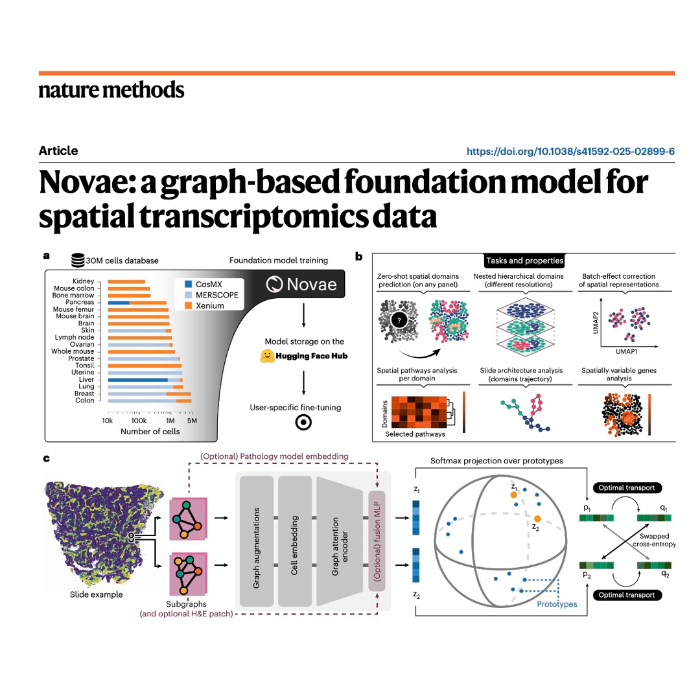Okay, so we have these localized, robust, and translated subgraphs. How does this graph attention network actually learn the identity of those spatial domains? This is where we fuse the SwAV framework with optimal transport. SwAV is a self-supervised method designed to learn structure by agreement. It looks at two slightly different views of the same local neighborhood, our subgraphs, and it expects their representations to belong to the same underlying domain. Okay. To do that, Novae learns prototypes. You can think of these as high-resolution learned embeddings that represent the fundamental building blocks of all spatial domains. So the prototypes are the foundational knowledge bricks, the dictionary of tissue microenvironment.